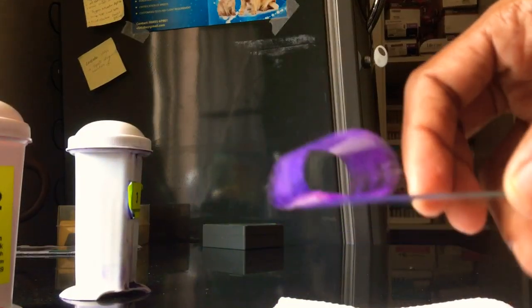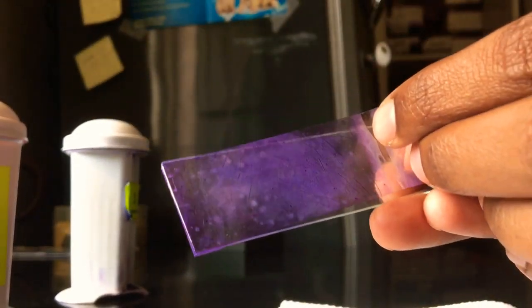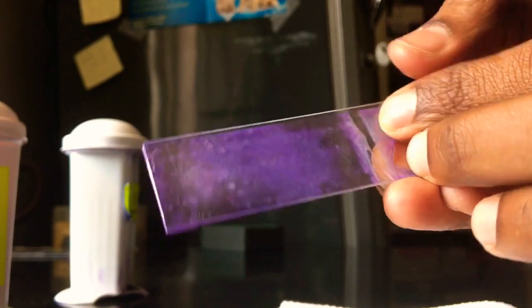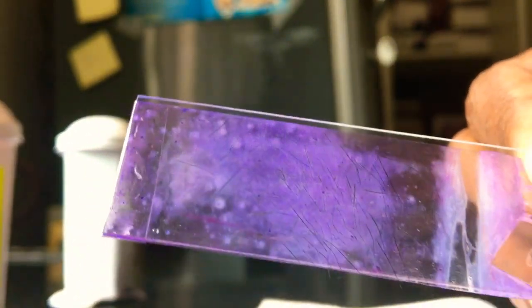After 10 seconds, you can remove the slide from the stain, wash it in tap water, and air dry the smear properly. Once it is completely dry, remove the tape and paste it on the slide, like how you would place a cover slip.